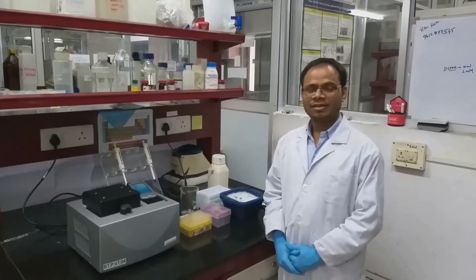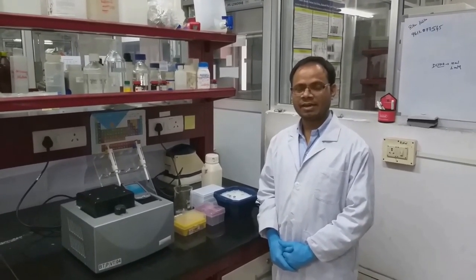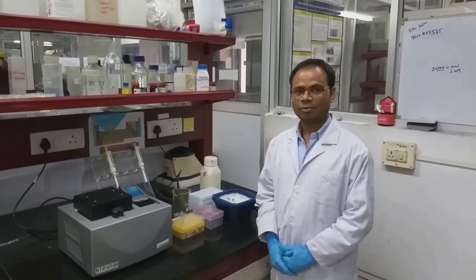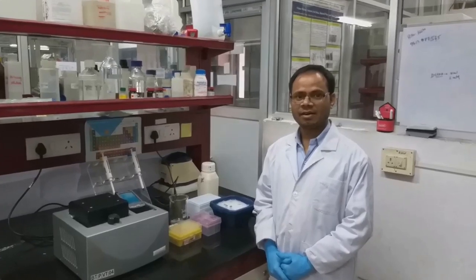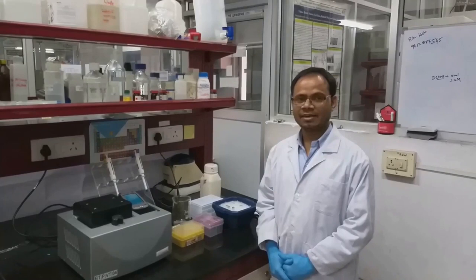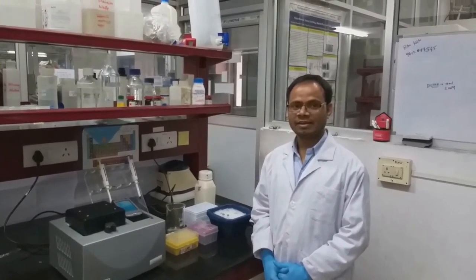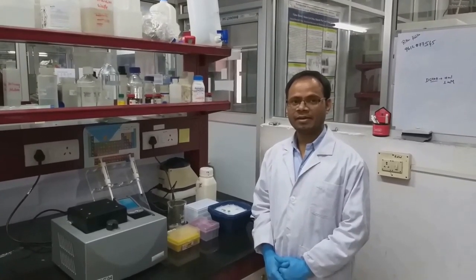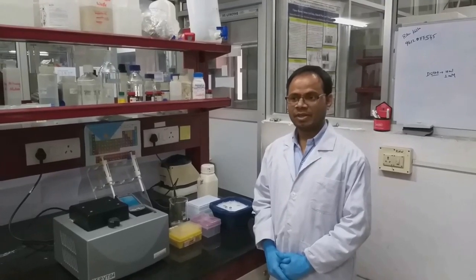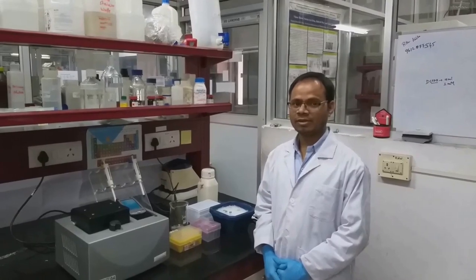Hello everyone, in this video we will be demonstrating how to set up a PCR reaction and analyze the results using agarose gel electrophoresis. PCR, or polymerase chain reaction, is a widely used molecular biology technique to amplify a particular segment of DNA. It is also employed in biomedical research and forensic medicine. The main application of this polymerase chain reaction is cloning.